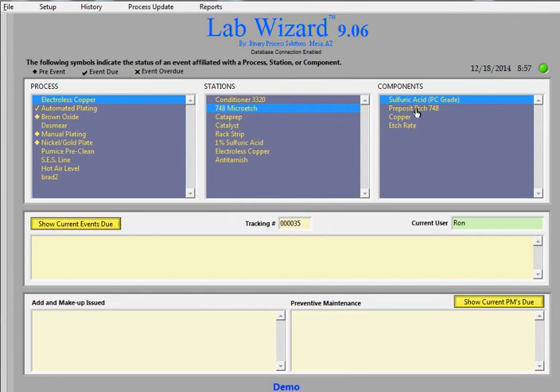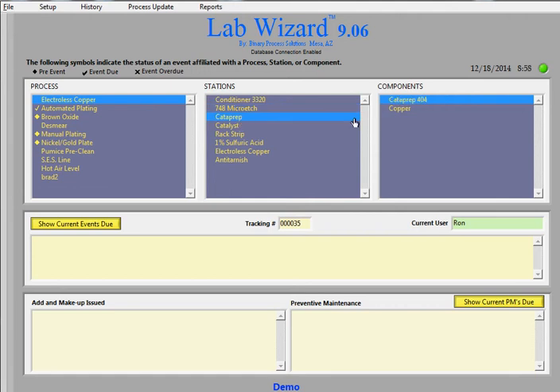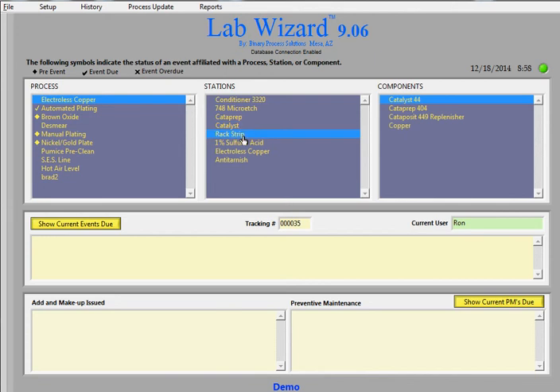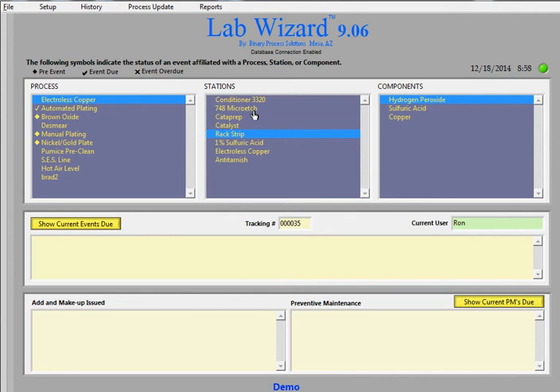Sulfuric acid, peroxide etch, copper, and etch rate. Here's a CAT-A prep that has two components. A catalyst that has four components. And so on. So every single process can be customized and set up exactly how you want it with the chemicals that you want analyzed.